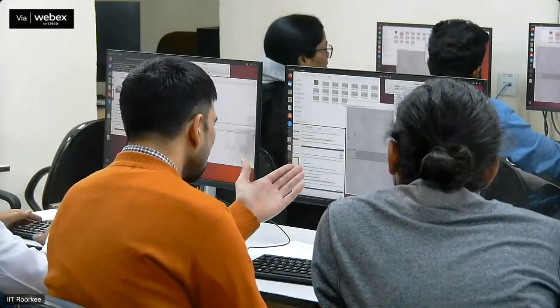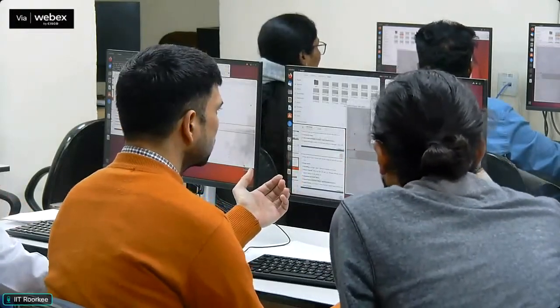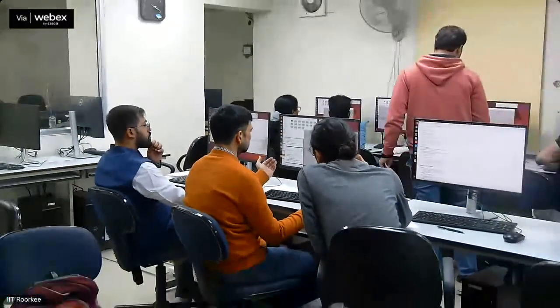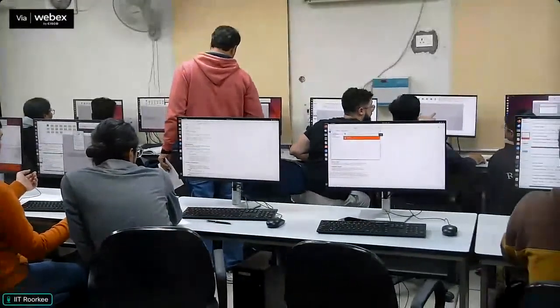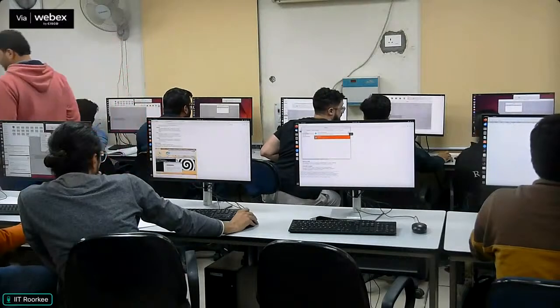Okay, then find out the inner diameter of the tube. Yeah, that is 7 mm. Then again draw the straight line, and Control M for analyzing. Yeah. That is the inner diameter.